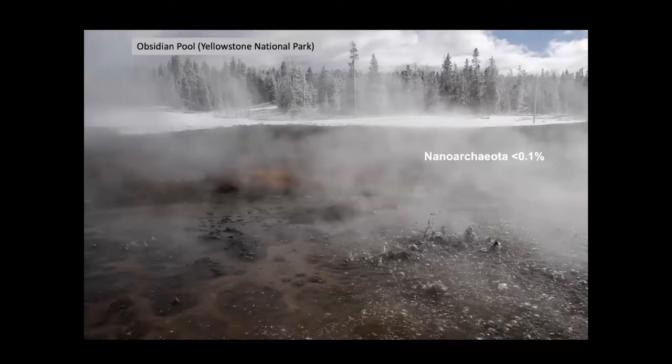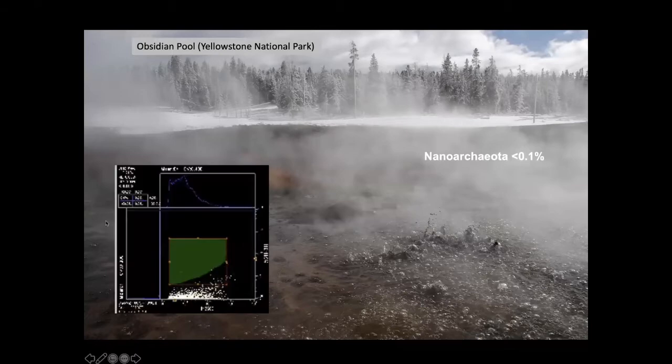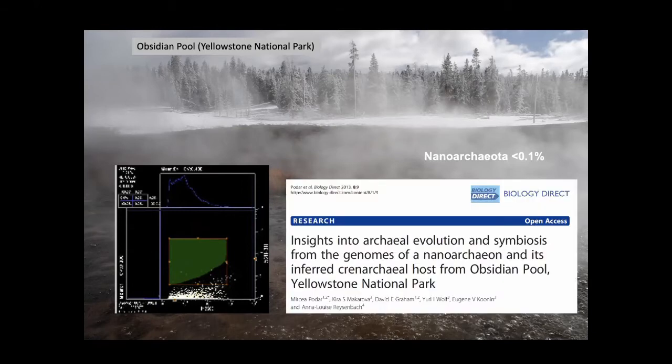So we applied that to some samples that we got from obsidian pool in Yellowstone, where these nanoarchaea are actually quite rare. They're less than 0.1% of the community. But using that antibody that we raised against equitans, we got some fluorescent cells, and I know this doesn't really show very well on this picture, but in this gate there were few fluorescent cells, and we isolated them and we sequenced them, and essentially we discovered a novel nanoarchaeota lineage in the obsidian pool, and those cells were attached to their host, so they came together with the host.